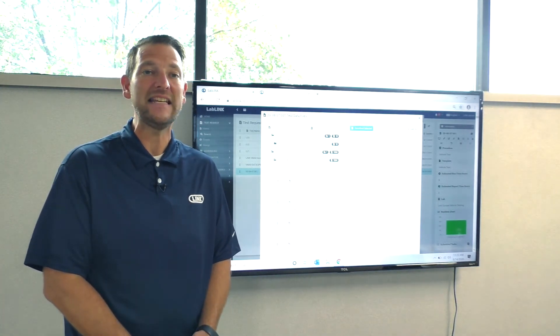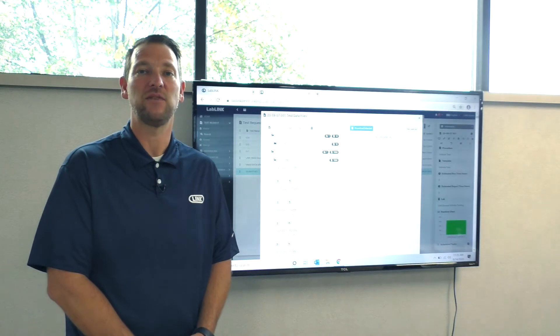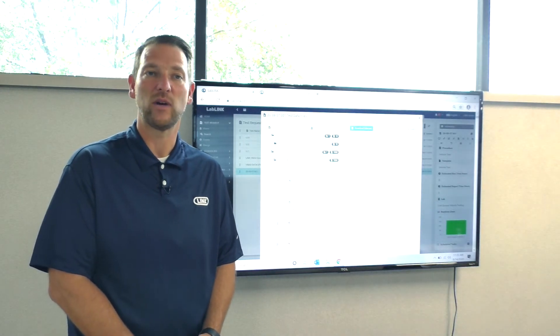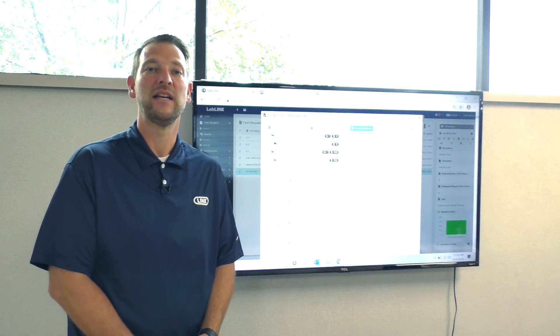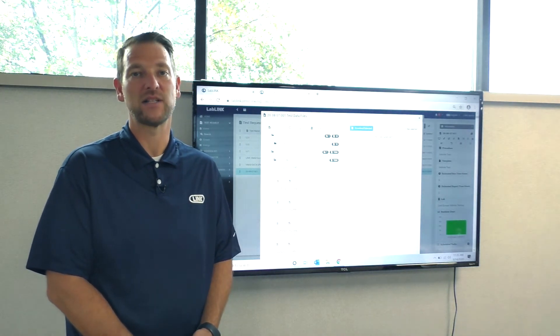If needed, even test data analyzed outside of LabLink can be stored in the data warehouse module as an attachment to the test request.